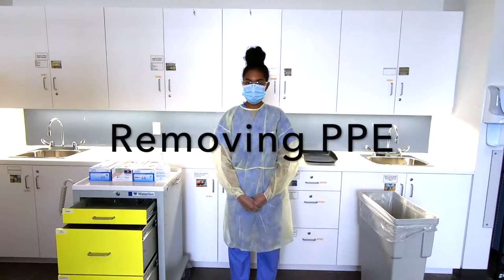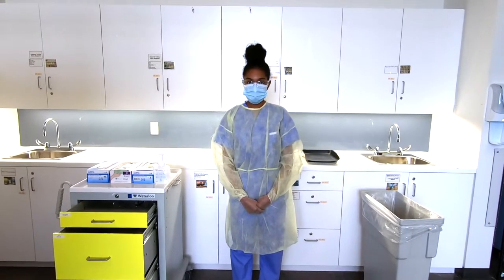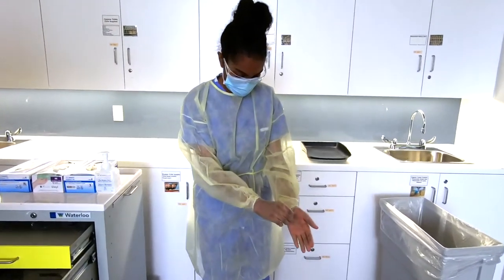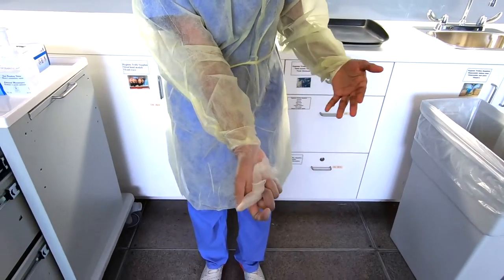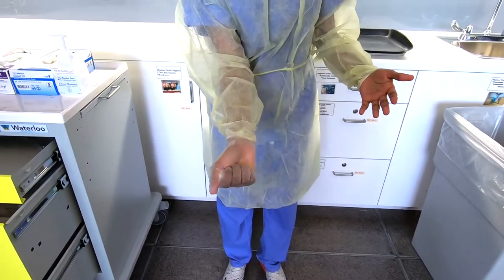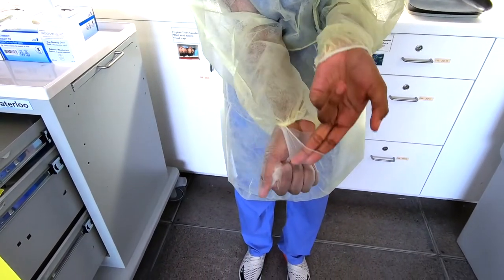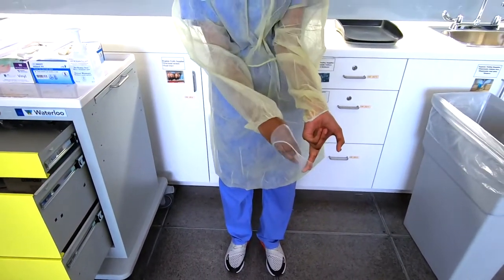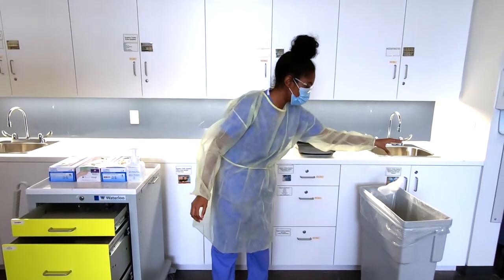To remove the PPE, we begin by removing the gloves using the glove-to-glove, skin-to-skin technique. Pinch the middle of the glove and pull away from your body, cusping it into the other hand. To remove the second glove, slide two fingers underneath it and pull away from your body, not touching the outside of the glove as it is contaminated, then discard.